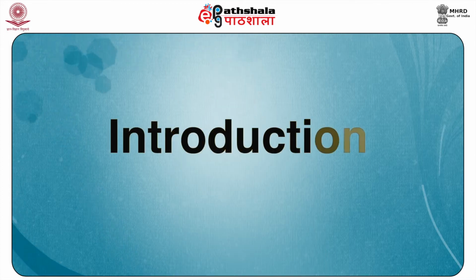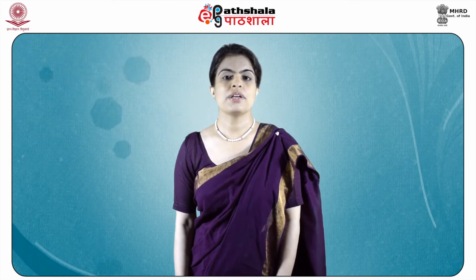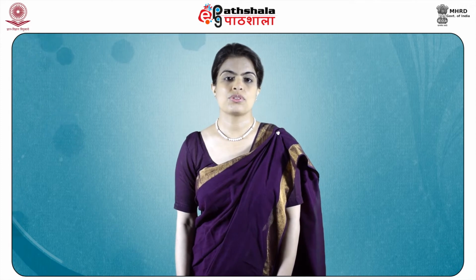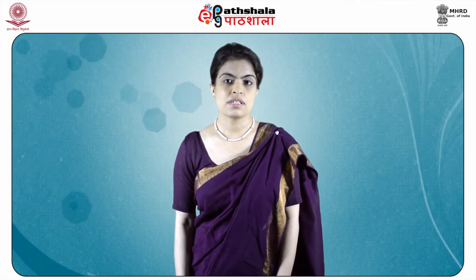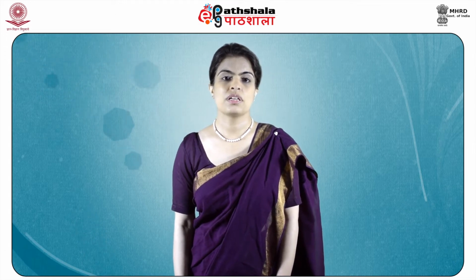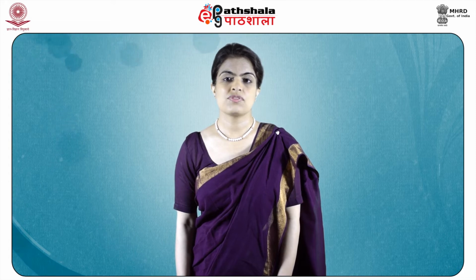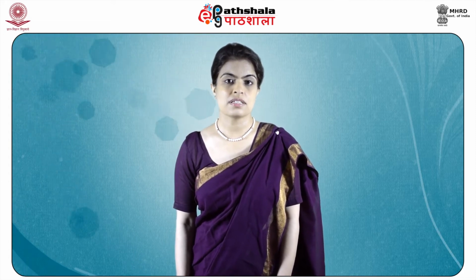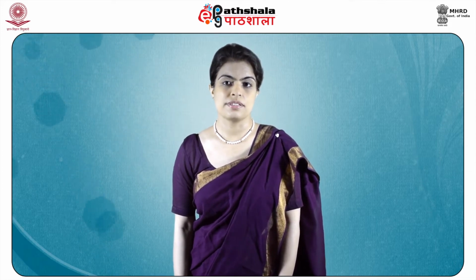To introduce you to the ion exchange chromatography concept, ion exchange chromatography is a biochemical technique widely used to separate molecules on the basis of their net charge. This module describes the basic principle behind the working of this technique. It also introduces the reader to various kinds of materials used as resins that make up the matrix bed and the various ionic functional groups that are bound to the resin.